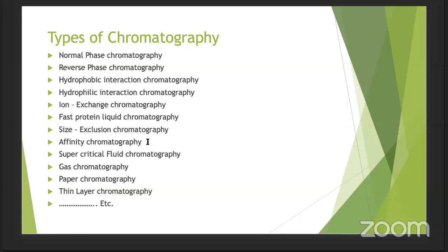You use an antigen or some molecule that has affinity for the antibody, and you pack the column with it. When the lysate with the antibody is flown through the column, it forms a bond with the antigen, and this is how it gets held up in the stationary phase of the column. Further, you change the conditions like pH, temperature, or solvent, and then you elute the antibody.